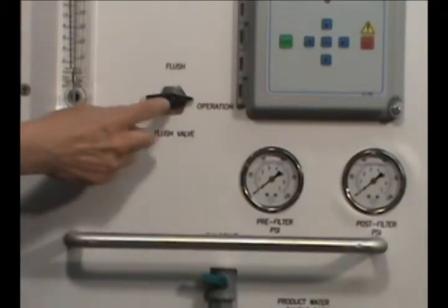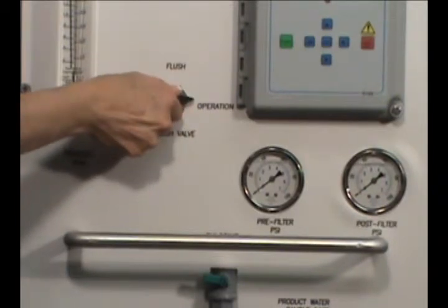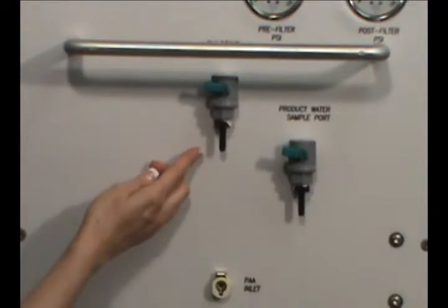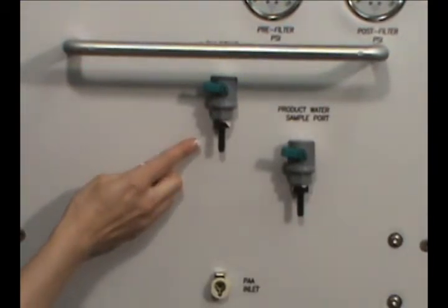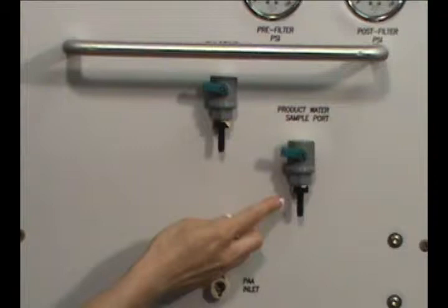Other fittings and gauges include the flush valve, which increases the flow rate through the unit to flush the membranes and other components. The chlorine sample port is used to verify the pre-treatment filters are working properly. The product water sample port provides access to a sample of the RO's product water without disconnecting hoses on the system.